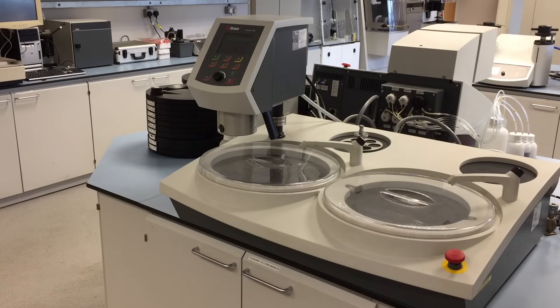Designed for reliability and speed, it has been proven to reduce the time for grinding and polishing by up to 50% against our competition, whilst producing consistent reliable results. This is a considerable time saving and will increase productivity.